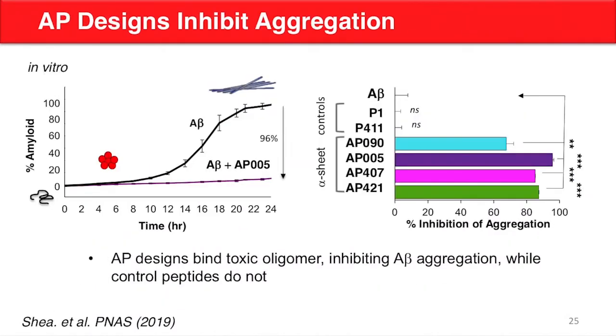So another thing we tried is we have this time course for the THT, and this is shown on the left of this slide, lower concentrations. So you can see the kinetics are a bit different if you're following that.